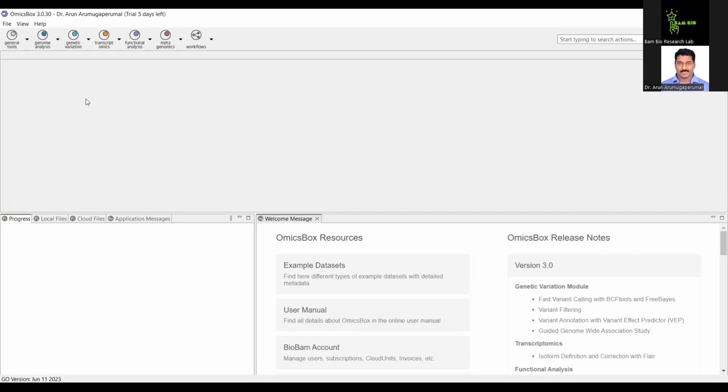What the 1 and 2 signify is that in next generation sequencing, to improve the accuracy of the sequencing, they sequence in the 5' to 3' direction of the DNA piece, and simultaneously they sequence in the reverse direction, 3' to 5'. The result from the 5' to 3' sequencing will be your forward reads, and the sequencing from 3' to 5' of the same piece will be your reverse reads. So for a particular piece of DNA, you will have two sequencing results, one forward read and one reverse read. These are called paired reads because they are complementary to each other. These two forward and reverse reads are separated into two different files, and they are named _1 and _2.